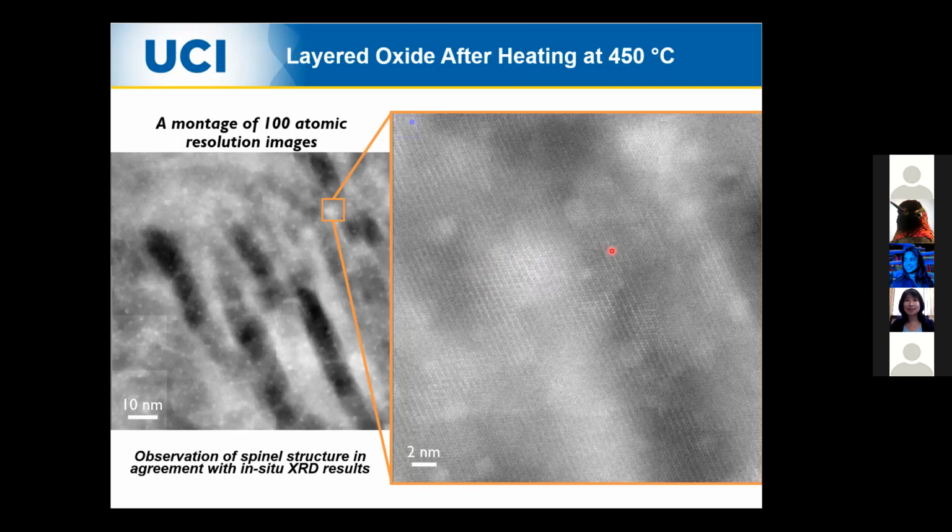Sorry, Jean, can I ask, the white spots, are they individual atoms? They're individual atomic columns. Columns, okay. Yeah. So they're not individual atoms. They are individual atom columns. So this is a periodic crystal you oriented onto a so-called zone axis, and you have columns of atoms that are aligned. Right. And there's off axis depending on the resolution. This contrast will show up, and you don't see it. And there's about 3 or 4 of them in this picture.